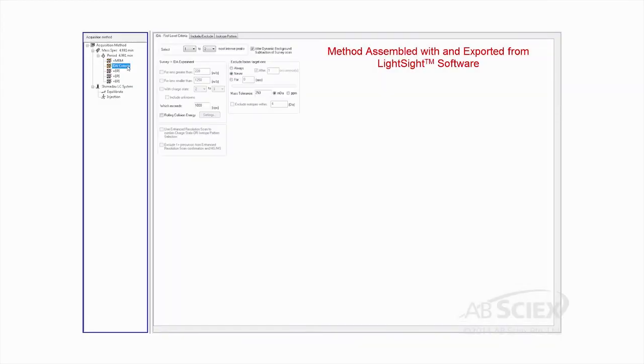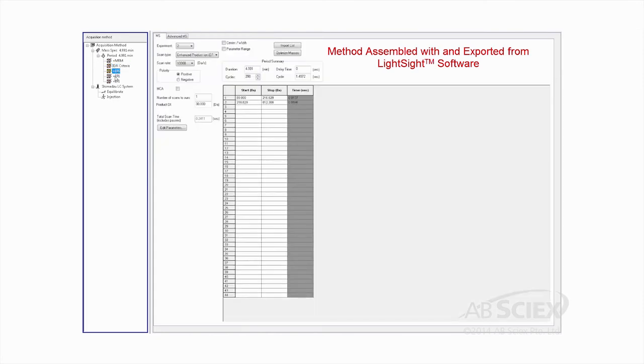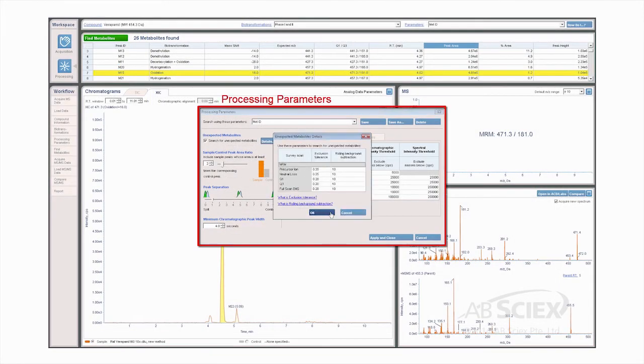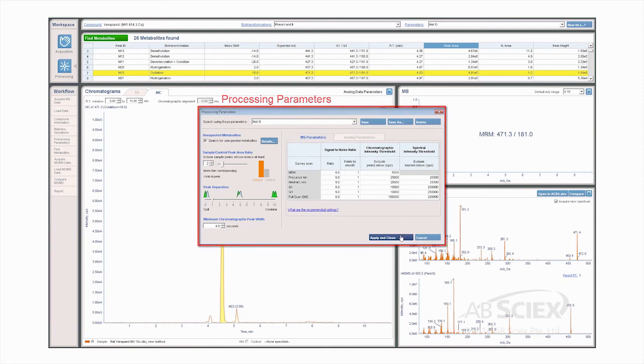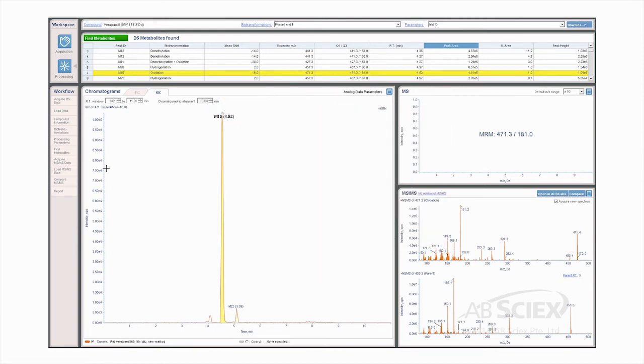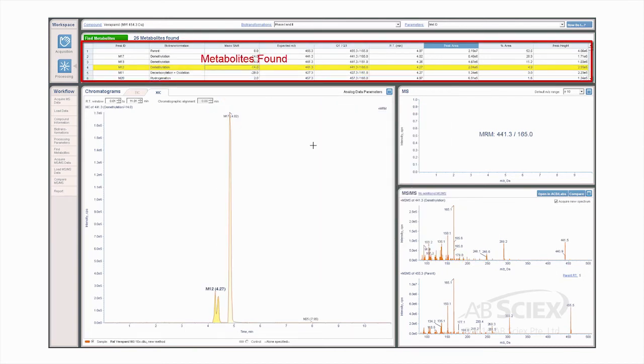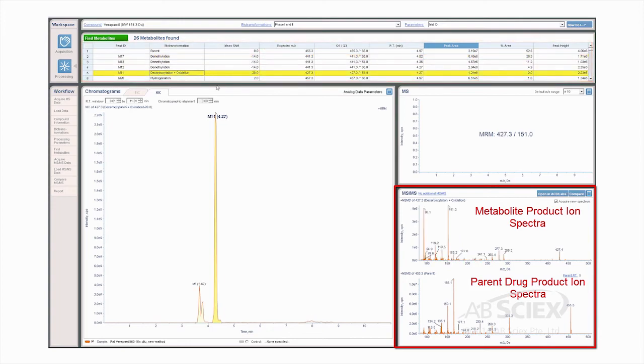LightSight software integrates automated method building and intuitive data processing and review. In addition to superior LC-MS/MS peak finding, LightSight provides the ability to analyze UV or radiochemical chromatograms in parallel. No matter what your level of expertise, LightSight effectively streamlines the entire met ID process from data acquisition through analysis and to reporting results.